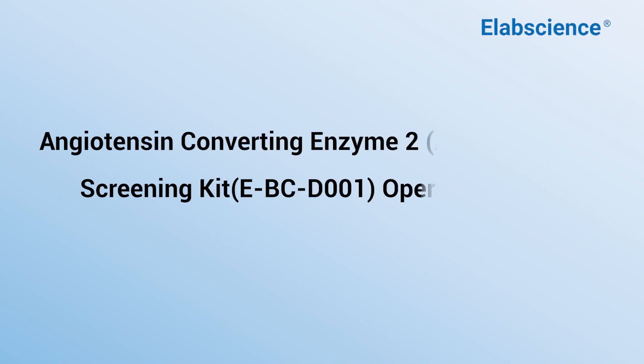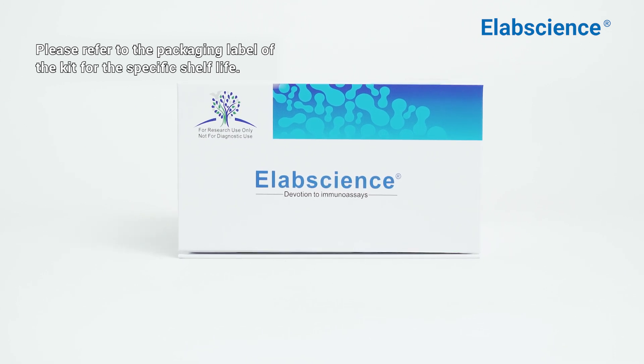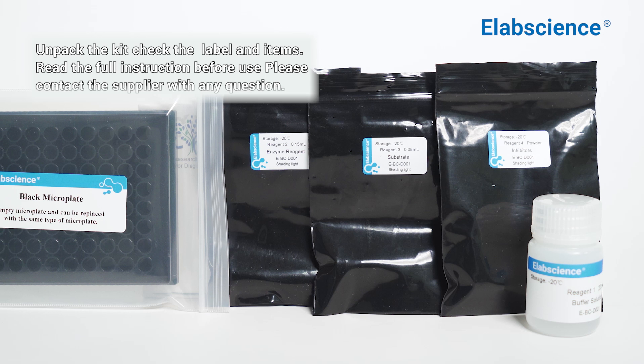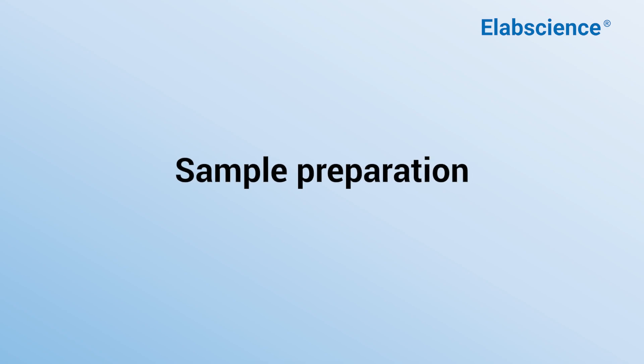Angiotensin converting enzyme 2 inhibitor screening kit operation guide. Please refer to the packaging label of the kit for the specific shelf life. Unpack the kit, check the label and items, and read the full instructions before use. Please contact the supplier with any question. Sample preparation.